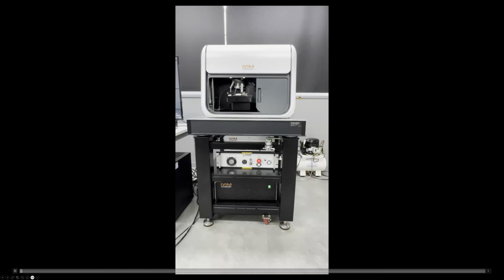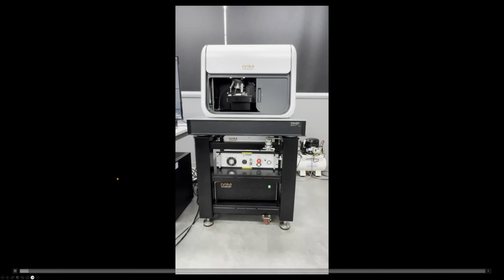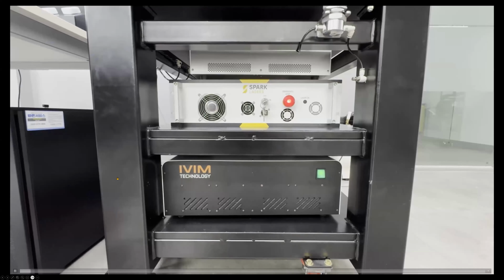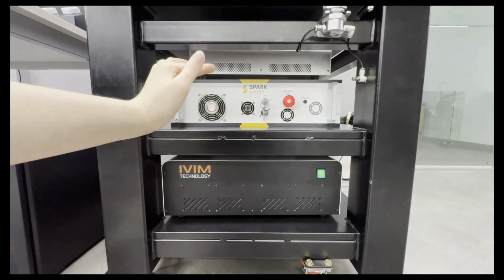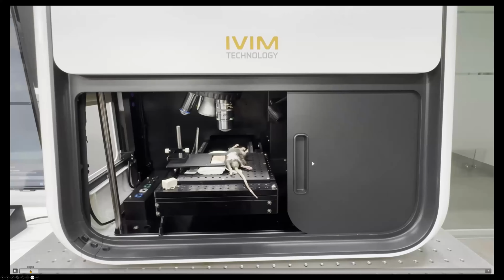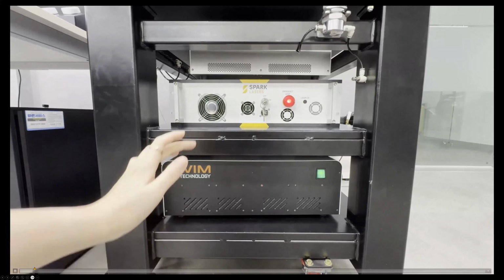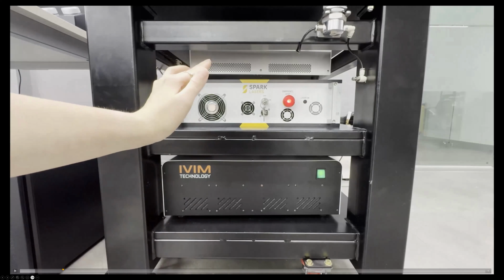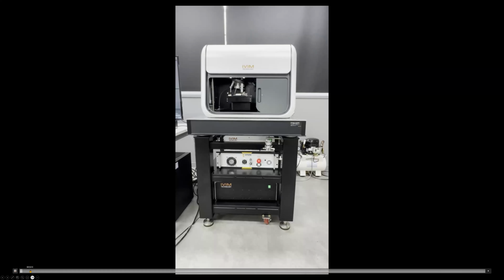Okay. So I'm currently showing the actual appearance of the equipment. At the top, you can see the main body of the microscope, while at the bottom there are various supplies. Zooming in on the bottom, you will notice three main devices: the main power supply for the microscope, and the power supplies for the two-photon and the confocal laser. Next, I will explain the main body in more detail.